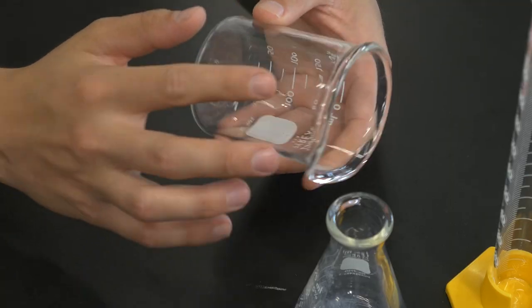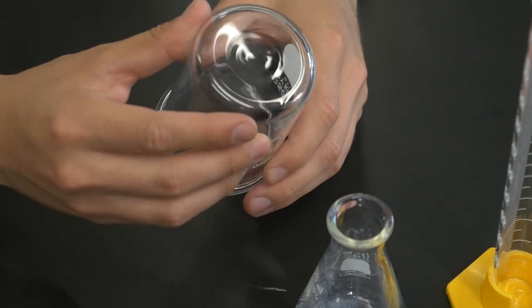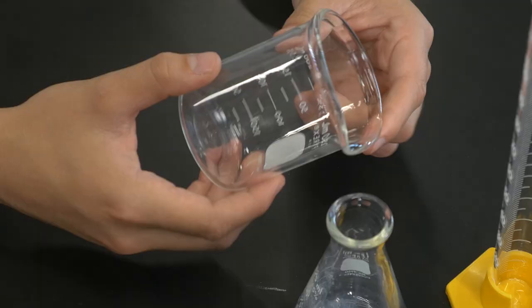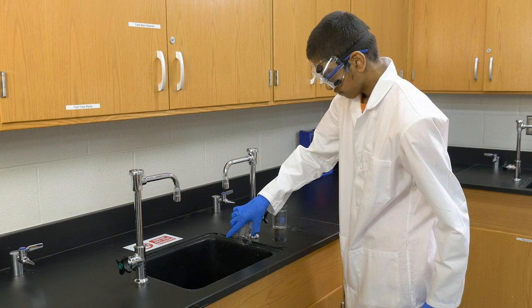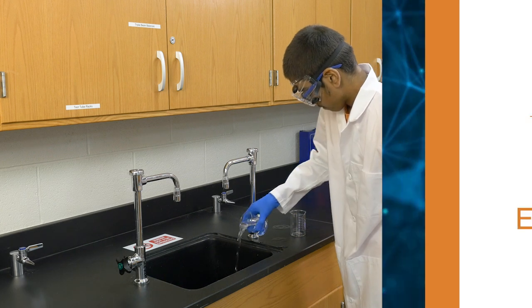Check glassware for broken edges and cracks before beginning each activity and inspect electrical equipment before use. Finally, be sure to discard leftover chemicals and any products or byproducts from the experiment as directed by your teacher.